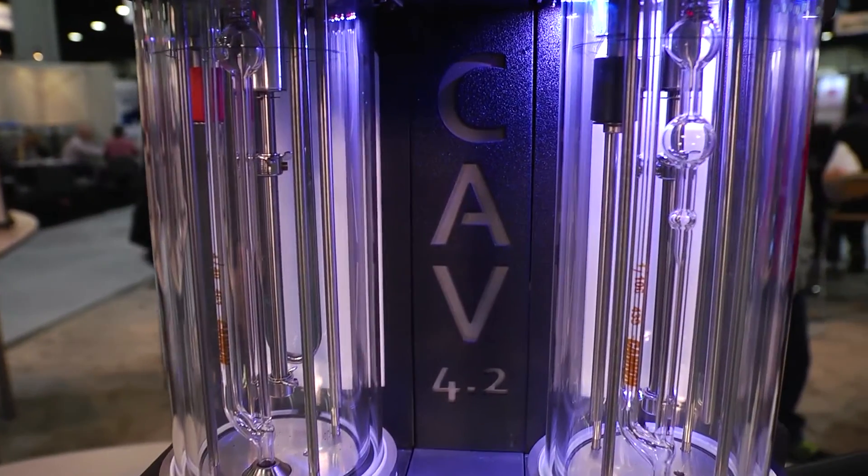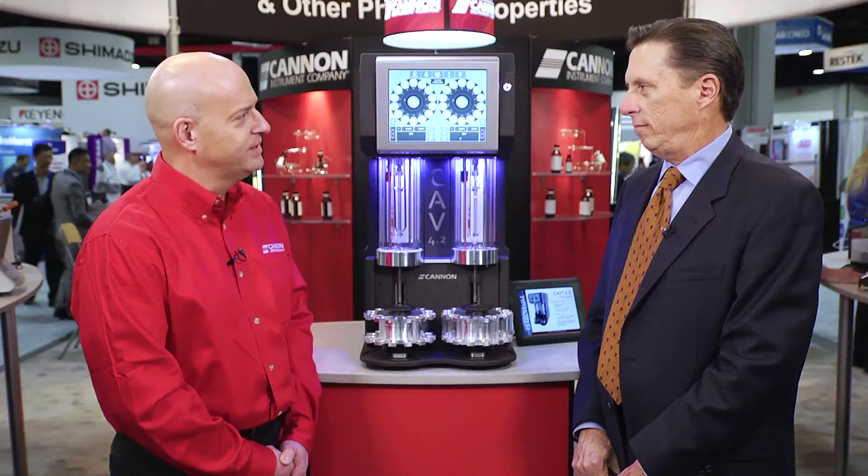That's correct. This is the most advanced fully automated viscometer that Canon has produced, and we've been producing automated viscometers since 1972. This instrument culminates in the most advanced technologies we've been able to develop for both sensing the timing, controlling the temperature of the sample, and automating the entire process.